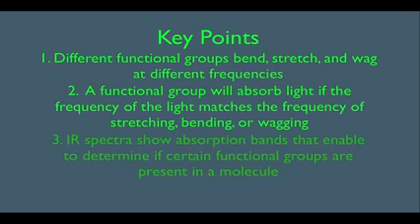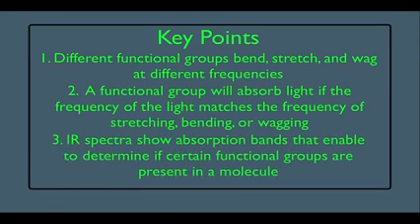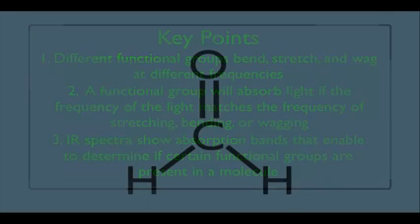And lastly, what we're going to see here is that IR spectra show absorption bands that enable us to determine if a certain functional group or groups are present in a molecule. So let's see how this works.